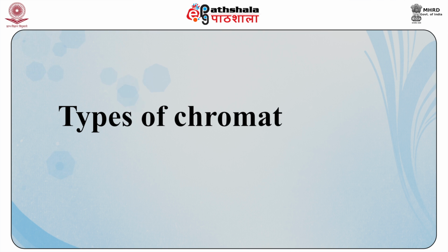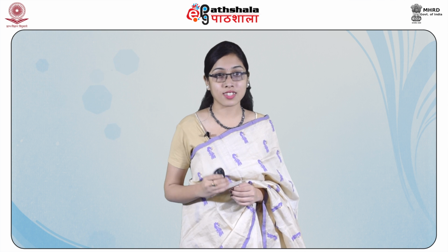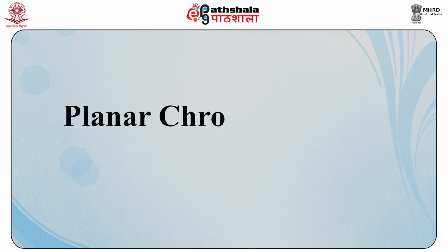Next, we will be studying about types of chromatography. Chromatography can be broadly divided into two types. One is planar chromatography and the second one is column chromatography. So, students, let us start first with planar chromatography.